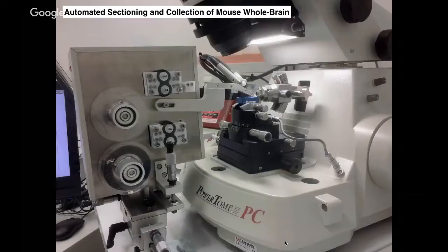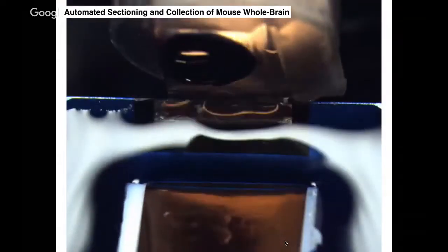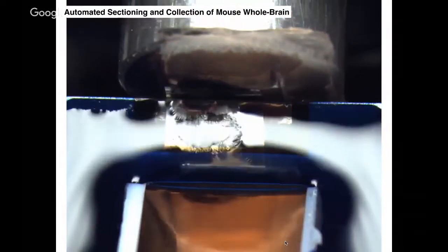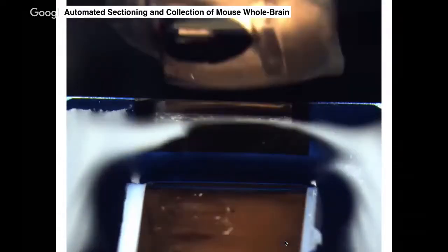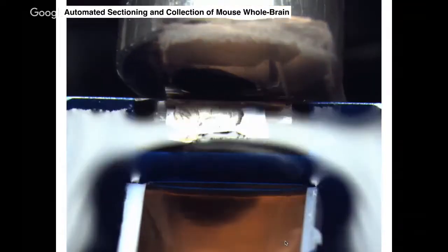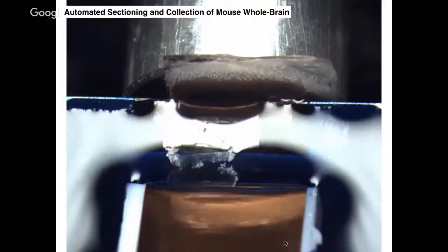And so, what I show here in the sample holder is one of these whole mouse brain samples. And if you go through and just start cutting, so this is through the olfactory bulbs of a mouse brain sample. Actually, it looks to be just a slab and not the whole brain in this case. So this is not the full size of the mouse brain. This is maybe 4 millimeters by 2 millimeters in area that it's cutting through. But you should be able to see both olfactory bulbs in these sections that are coming off. The sections are 50 nanometers in this case.